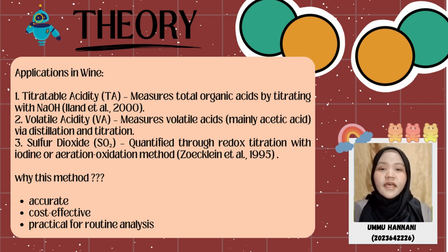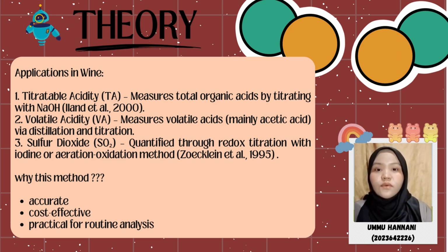Why is volumetric analysis so widely used? It is accurate, affordable, and perfect for routine checks, which is why winemakers rely on it to ensure every batch meets their standard. That's volumetric analysis in a nutshell, a simple but powerful tool that helps keep wine tasting great.